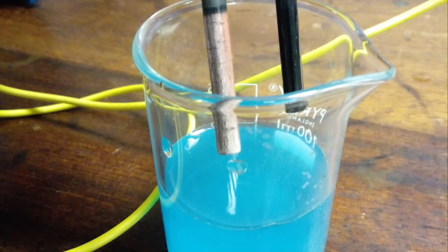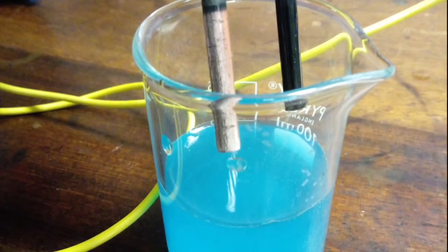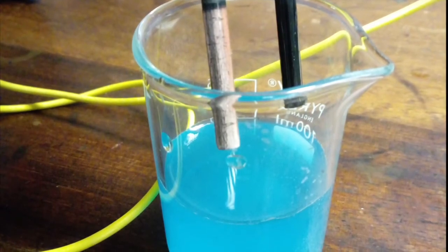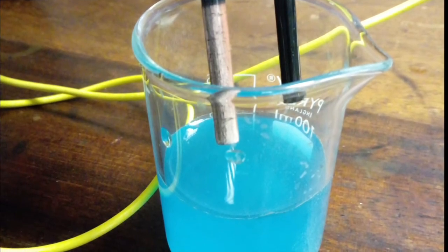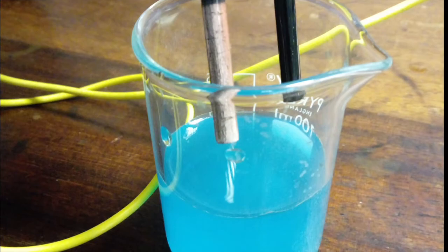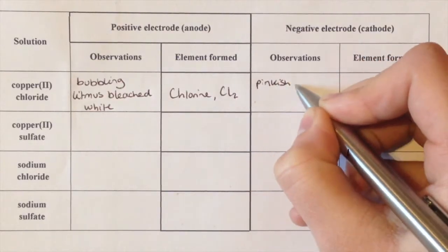Next, examine the cathode, the negative electrode on the left-hand side of the screen. If there is evidence of a pinkish metal deposit, then this indicates the formation of copper. Again, record your results in the table.